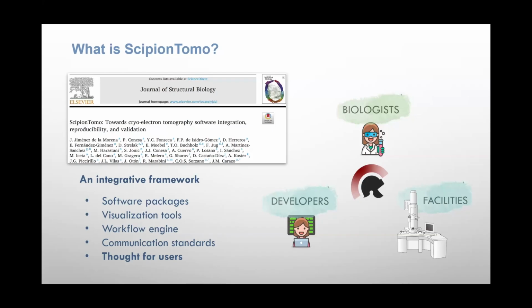To carry this out, Scipion has a standard behind it. All data formats are converted into the Scipion format, and from the Scipion format to the specific software that will be used for a specific task. In this regard, it's safe because the user does not have to make a data format conversion, which is always prone to errors.